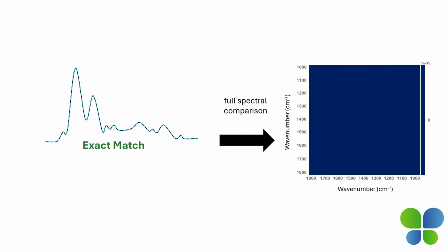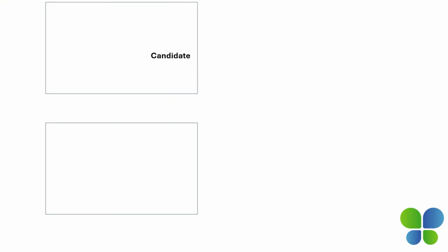Another possibility is when the absorbance difference is considered negligible, as defined by the target product quality attribute. The method can then be implemented to follow the ICH Q5E guideline as part of a comparability exercise. The implications may vary depending on the spectral region being evaluated.